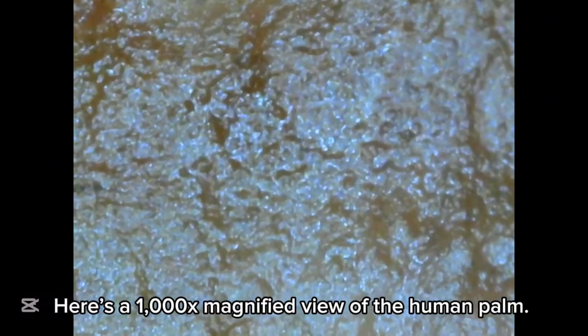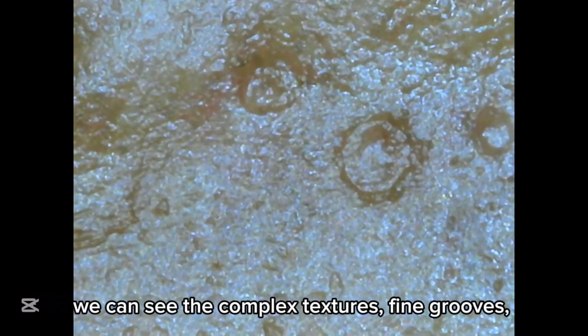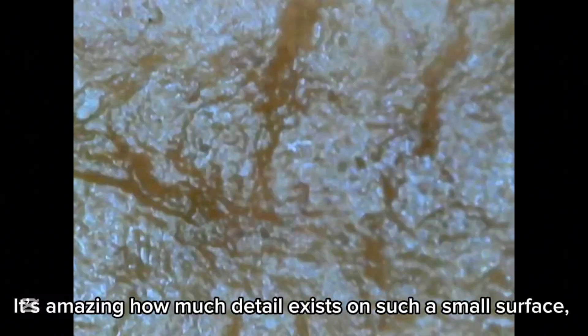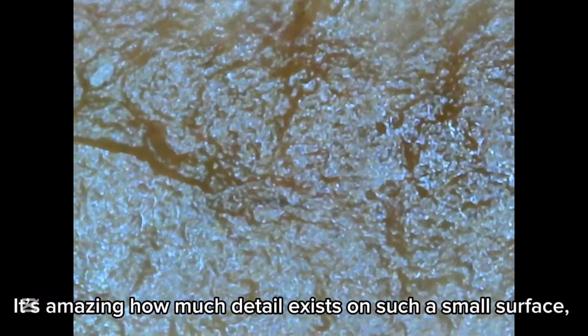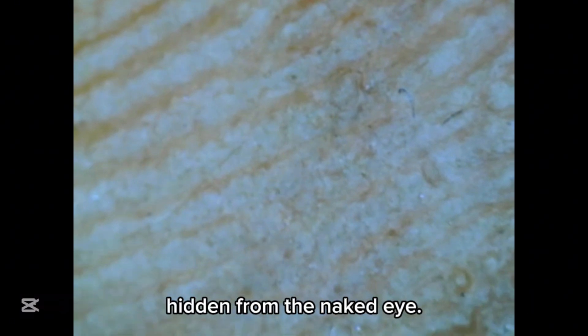Now let's take things even further. Here's a 1000x magnified view of the human palm. At this level, we can see the complex textures, fine grooves, and cellular structures that make up the skin. It's amazing how much detail exists on such a small surface, hidden from the naked eye.